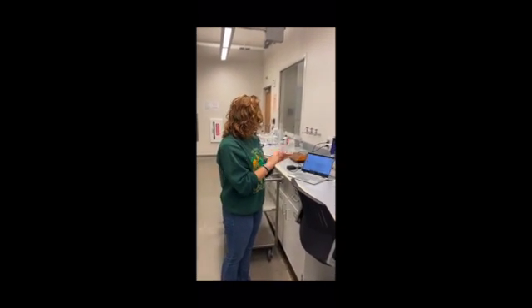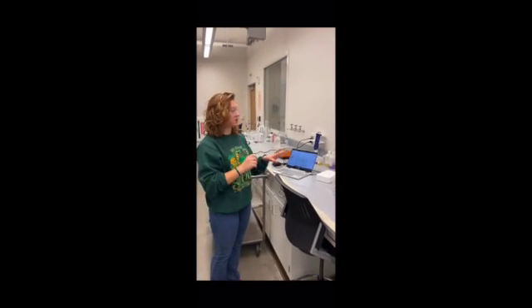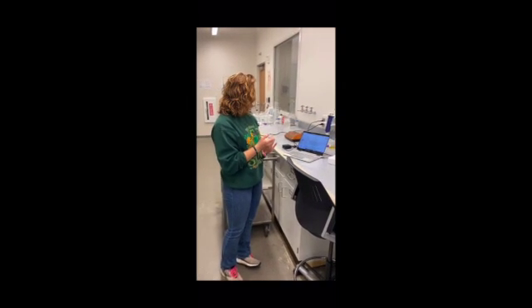And then that procedure was repeated for each of the test tubes and for each of the varying temperatures. We varied temperatures at 32 degrees Celsius, 55 degrees Celsius, and I think we did 1 test tube at 60 degrees Celsius. And that's it for the procedure.